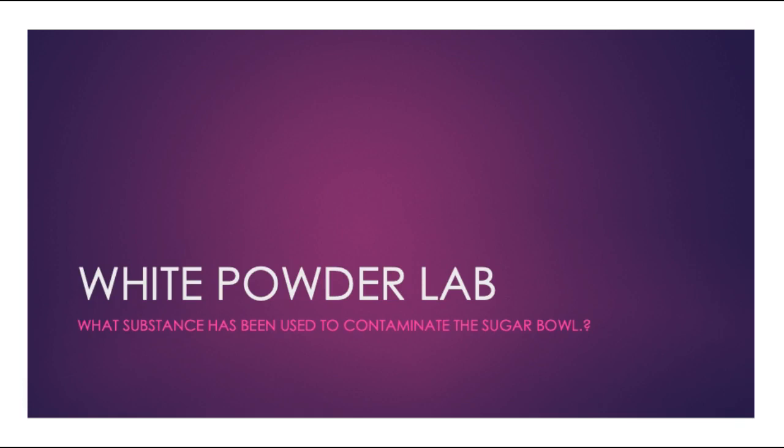So a substance has been added to the teacher's sugar bowl to get back at a teacher. And that substance, we've gone around, we found it's a white powder, and we've collected all of the white powders that we could find in the school, and we're going to be testing that unknown substance, and we're going to have those same tests applied to all of the white powders we've found to try and match it up. So if it is the same substance, then it should have the same physical and chemical properties.